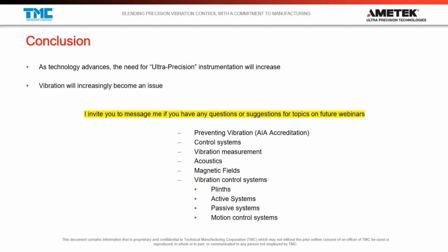A lot of optical microscope setups go on passive isolation tables. Those are going to do a great job at high frequency floor vibration mitigation, but they're going to have a resonant peak at 1 or 2 hertz, which could be giving you a problem due to building sway. But you're always going to have acoustics in your facility due to whatever sources.